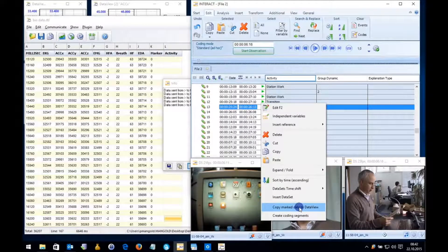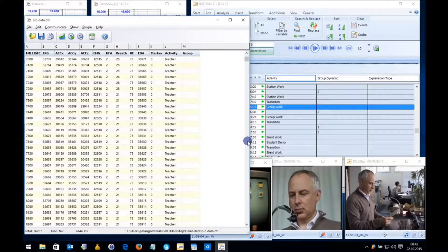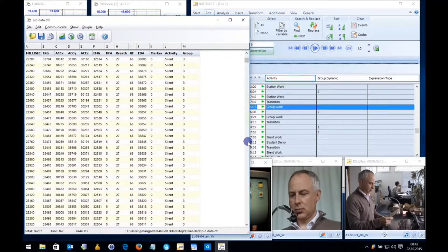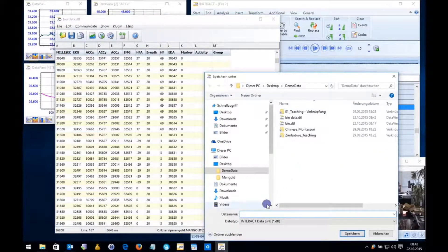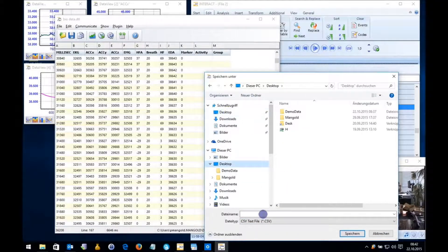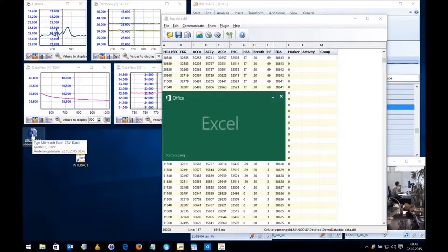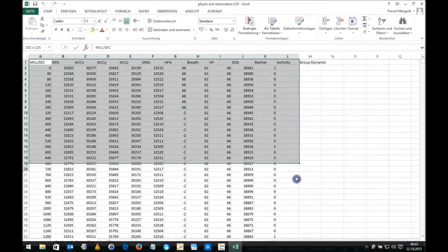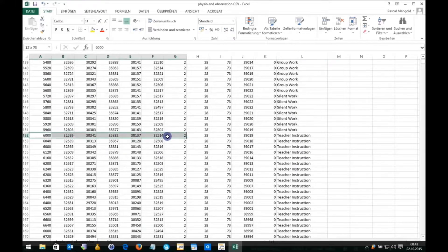If I select all of them and say 'create copy marked elements', I have my full observations — my observational codes added to the data file, as you can see here. I can simply save that file as a CSV file. I'll save it on my desktop as 'physio and observation'. There it is on the desktop. I just opened it in Excel, and now you can see that you have integrated your physiological measures with your behavior observations.